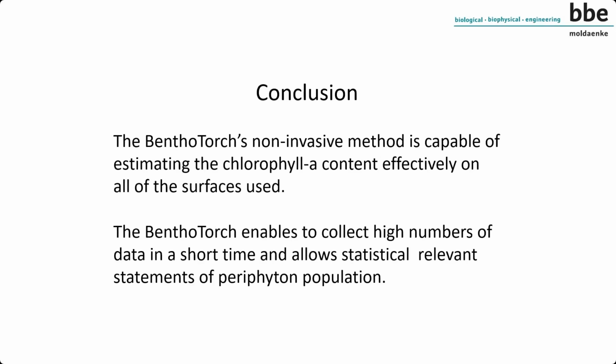So the conclusion I come to is that the BenthoTorch is a non-invasive method, so it does not disturb the algae cells. And to say it carefully, it's estimating the chlorophyll A content. We can say we try to measure it effectively on all surfaces that are used. I told you a little bit about the limitations. And we are able to collect a high number of data in a very short time and allow statistically relevant statements of the periphyton population. I think benthic population is a better word for that.